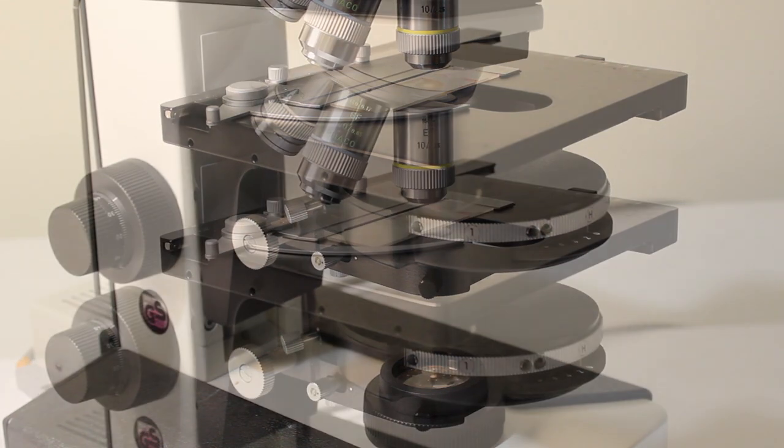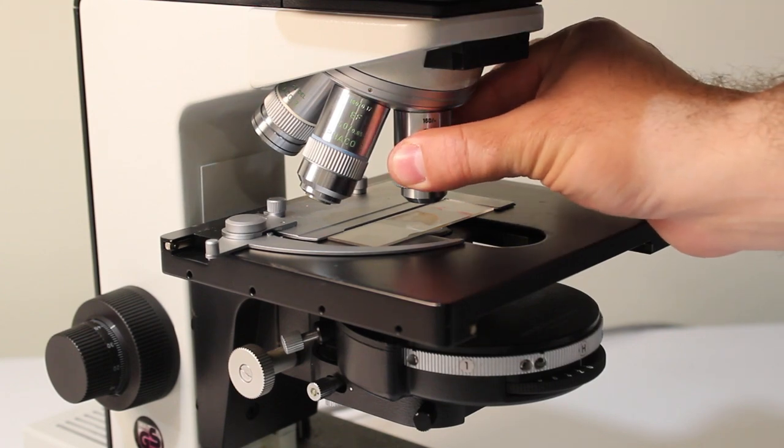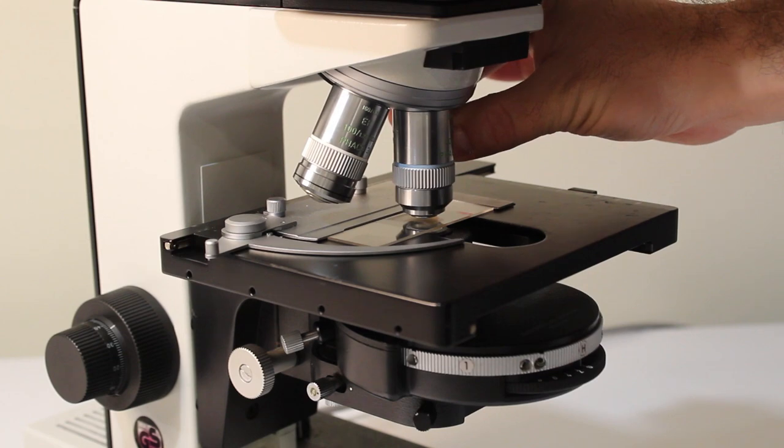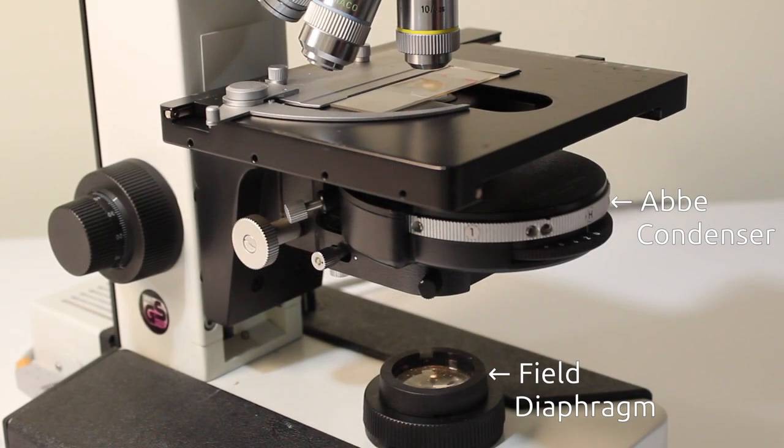For this video I am going to assume that you know how to focus on your sample and switch lenses. If you are unfamiliar with these processes, please watch episodes 3 and 4 of Microbrews. I am also assuming you have a microscope with a field diaphragm and an Abbe condenser.